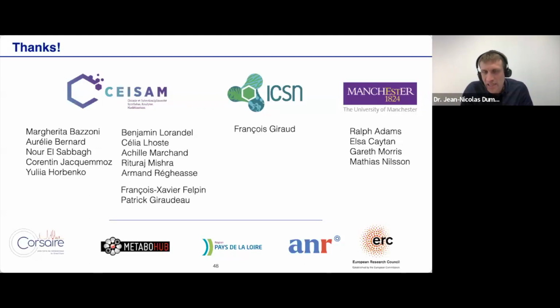It's something that has been characterized quite thoroughly, starting with the work of Stilbs, and of course with the work of the Manchester NMR methodology group. And it very much depends on, are the peaks fully resolved, and are you doing univariate analysis or multivariate analysis? In the case of well-resolved peaks, sometimes a 1% difference in diffusion coefficient is enough.